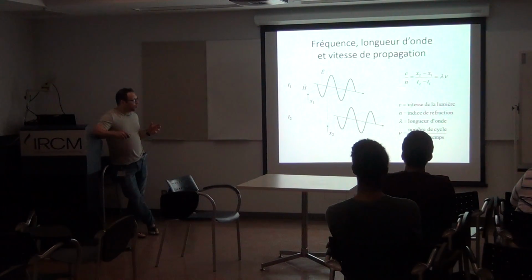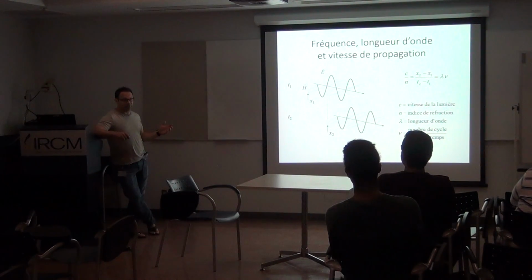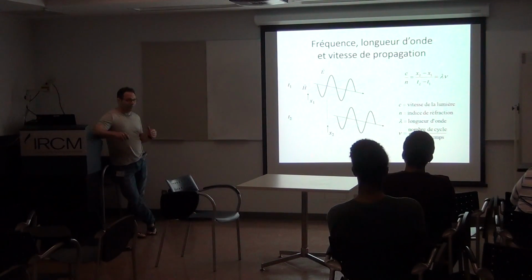And usually we will talk about refraction index of translucent things, so things that does not absorb light but just refract it. Okay, our body will absorb light, so that's why we don't see through. But most of living thing we are looking at, if it's really thin, then it's not going to really absorb. So if it's in water, so most of what we are made of will absorb light, but some of wavelength will not be absorbed.